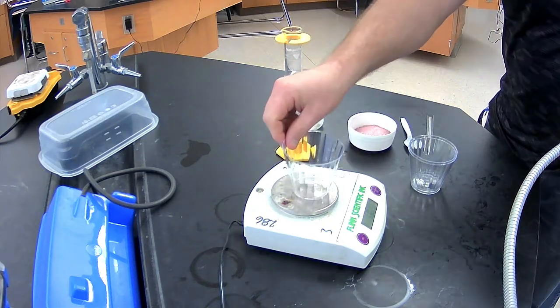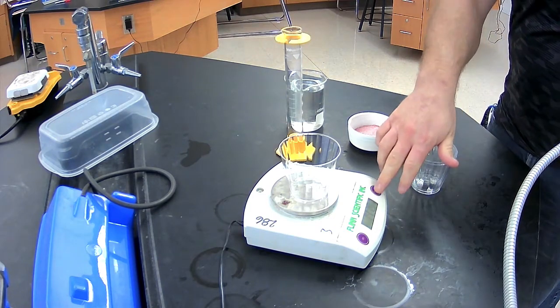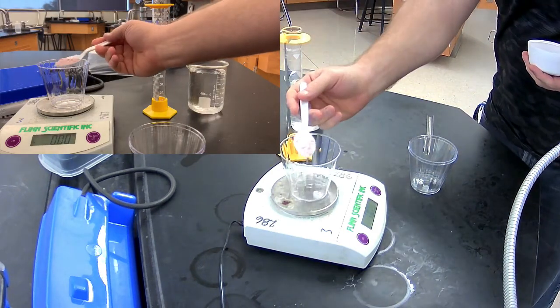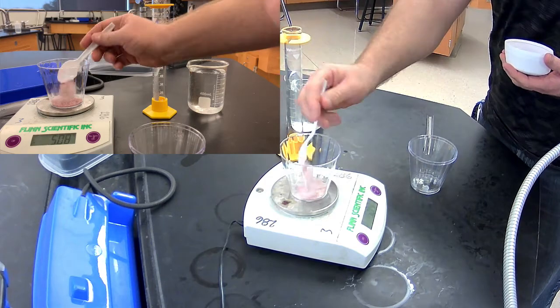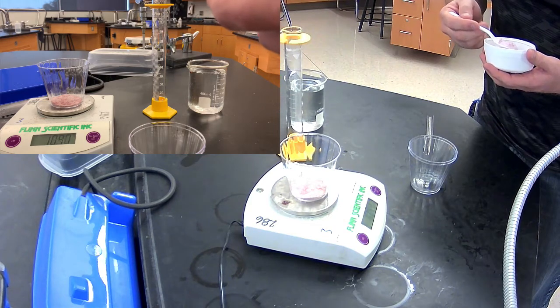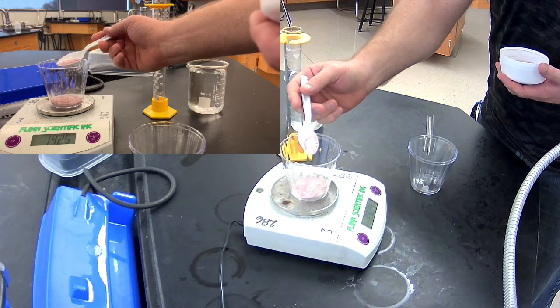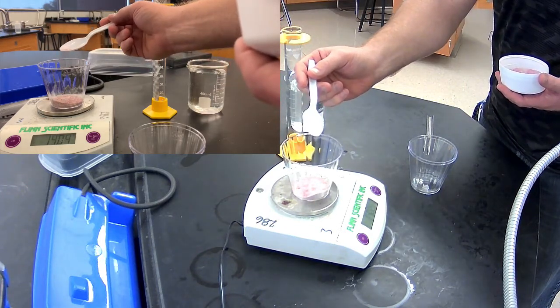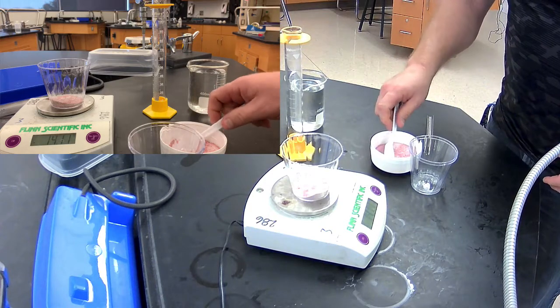So to do that I'm going to put my first beaker on my balance and I'm going to zero that out. And then I'm going to add in the proper amount of mass from my calculations, which was 14.1 grams. And that looks pretty good. So I had the 14.1 grams, which is needed for my stock solution.